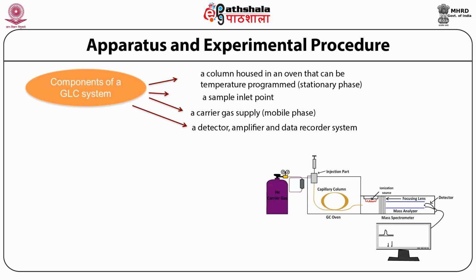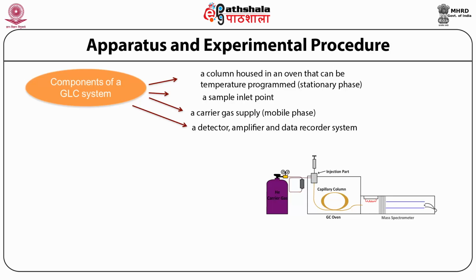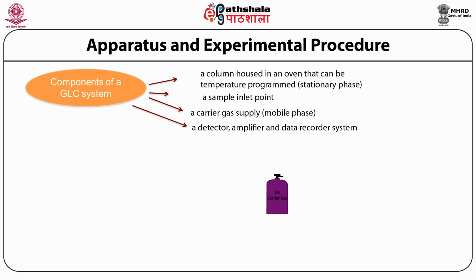As the lipid mixture, or the individual lipids that are getting separated, continue to move through the column, they will eventually reach the end of the column, and then they can either go through a flame which is used as a detector, and that is called a flame ionization detector, or they can go through a box that you see here, which is a mass spectrometer for further analysis.